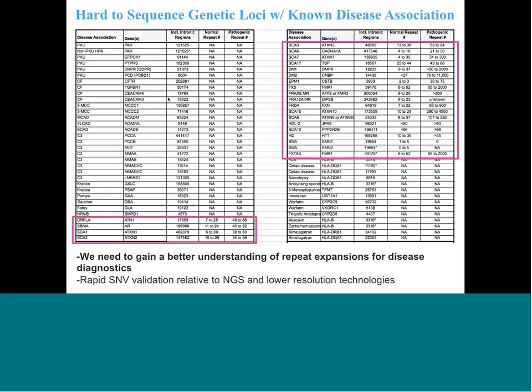And so the list that you can see there is just showing you the regions of the genome that could benefit from these technologies. And then outside of that box are just other structural variants, which might be anything from a CNV to a pseudogene.